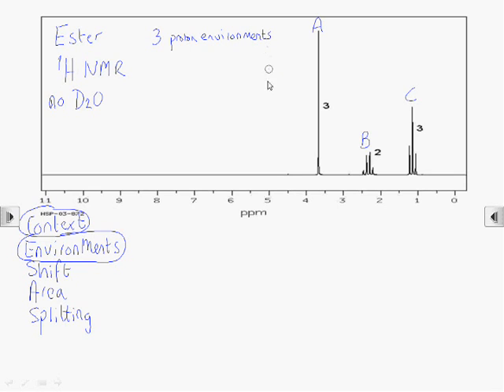And now we need to have a look at the chemical shift for each of those environments. So peak A, chemical shift of 3.7 parts per million. If you look that up on your datasheet, you'll see that environment is a proton on a carbon connected to an oxygen atom.